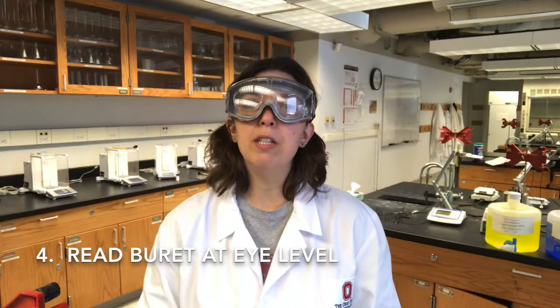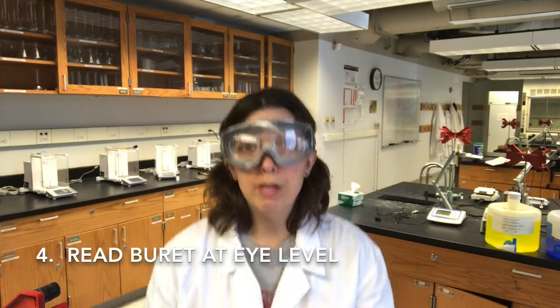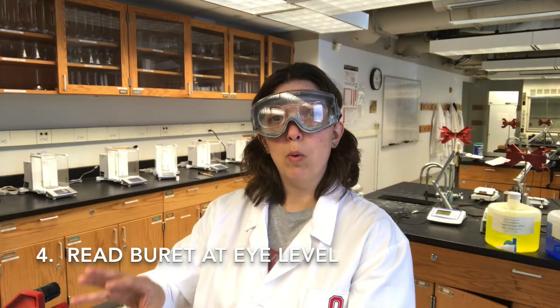Tip number four: make sure you're reading the burette at eye level. That may mean you need to use a stool, or you may need to scrunch down a little bit in order to get your eyes at eye level. You can also raise and lower the burette in the burette stand if that helps as well.